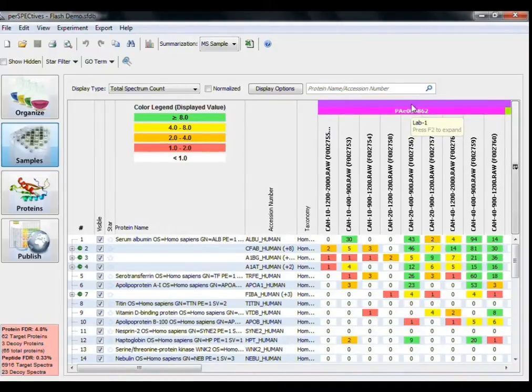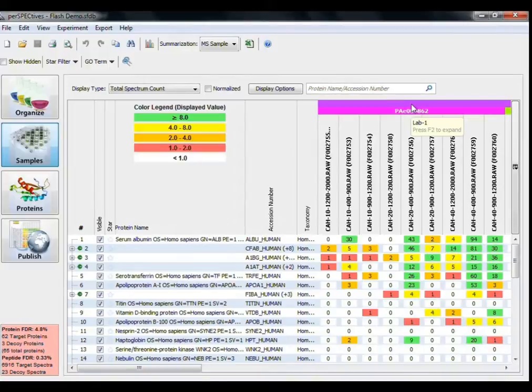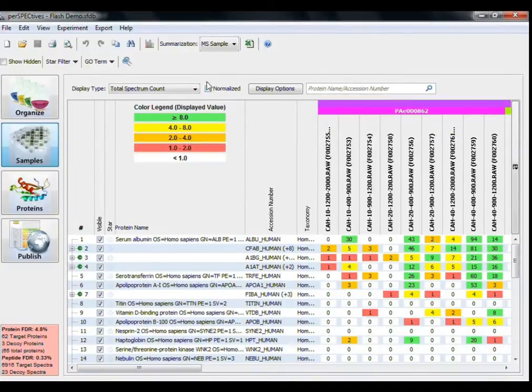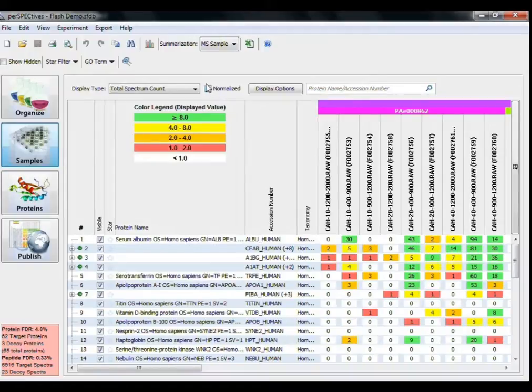The default values for each protein are not normalized, so if you want to normalize your values across the experiment, check the Normalized box here.